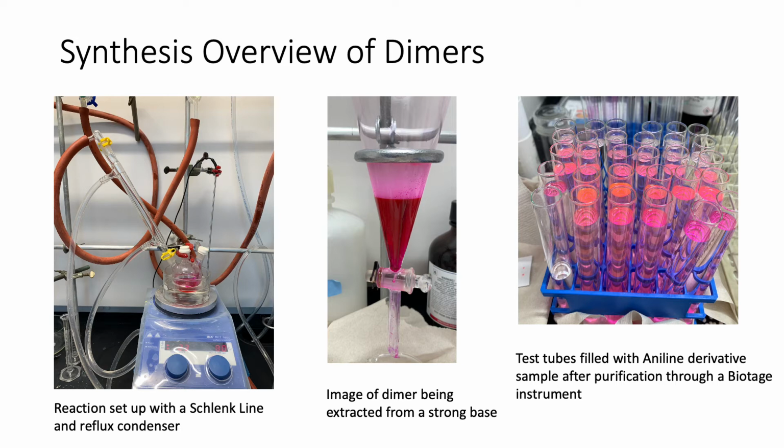So once this has been flushed with nitrogen and we have our solvent added via a syringe, we also must make sure we have a reflux condenser attached to this reaction because it needs to run in a hot oil bath as seen in the photo for about 4.5 hours so that no solvent is lost. We use the reflux condenser.